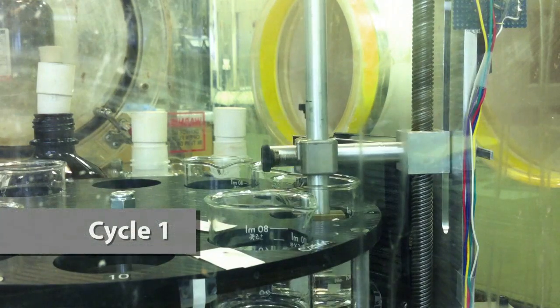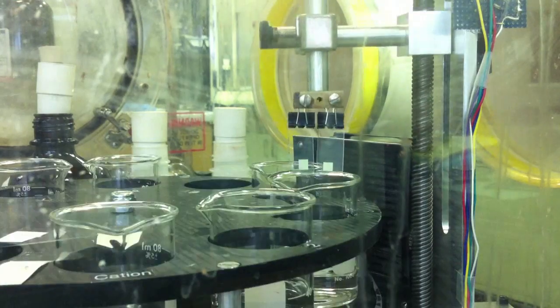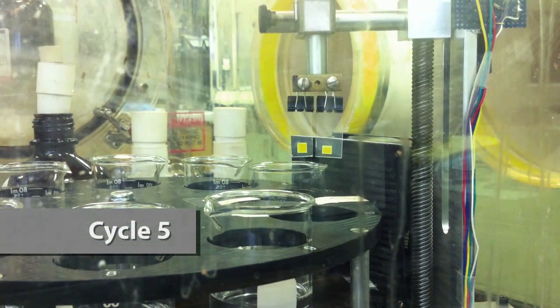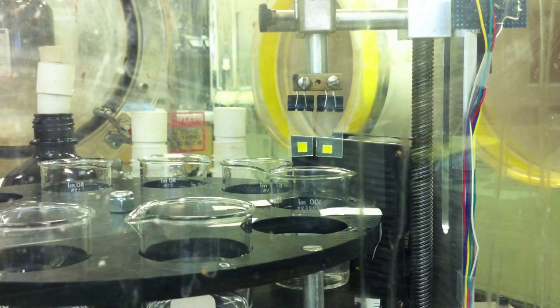During the first cycle of SILAR, we can see the white, unsensitized electrodes. And after five cycles, we can see the characteristic yellow color of cadmium sulfide.